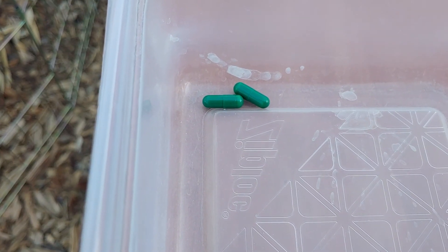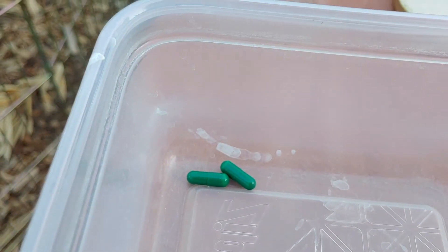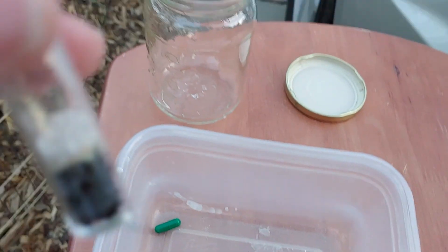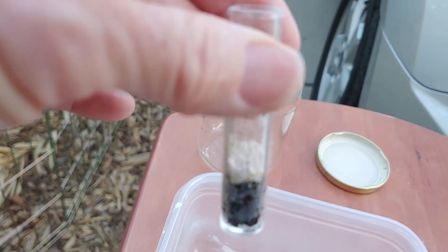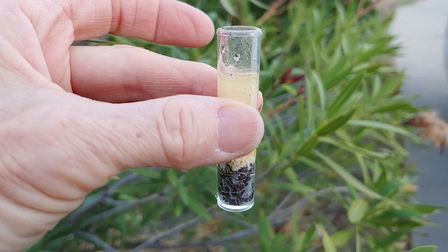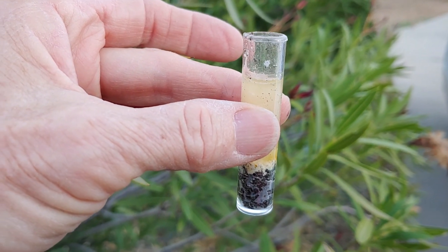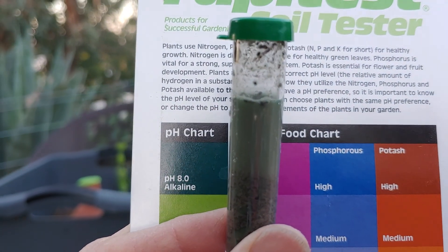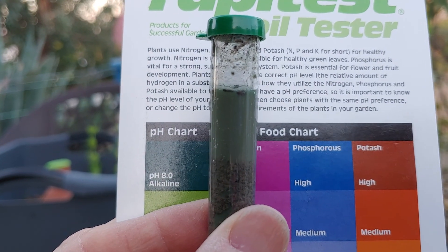I took out the green capsules and filled this test tube to the first line with the soil I want to test. I opened one of the capsules and put the powder inside the test tube. Then I put distilled water up to the fourth line, put the top on the test tube, and shook it. It looks like this particular sample is alkaline.